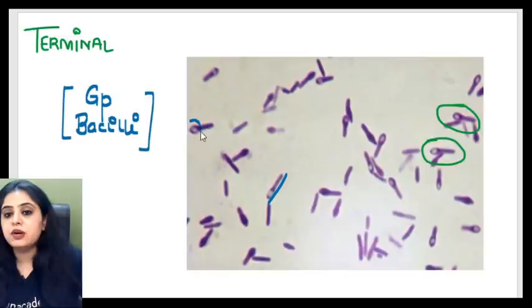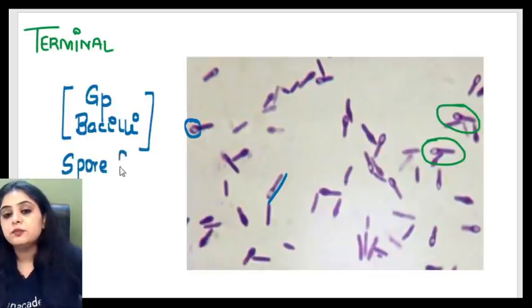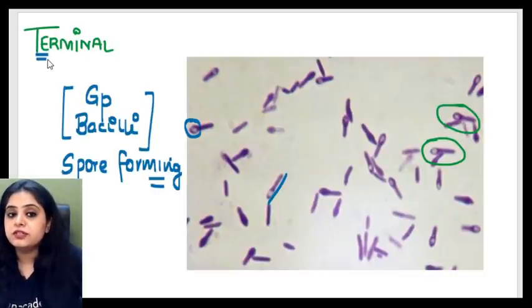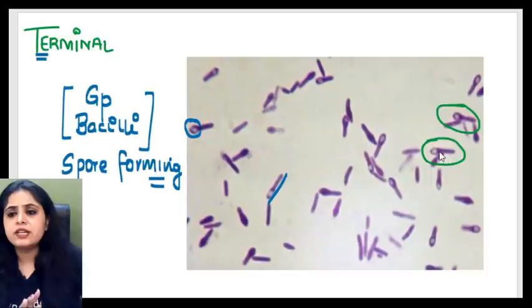Apart from the bacilli morphology, you can also see roundish structures present at the terminal end — so these are spore-forming bacilli, spore-forming organisms. Where the spore is located makes all the difference. In this picture, you can see the spore is present right at the tip, at the terminal end.